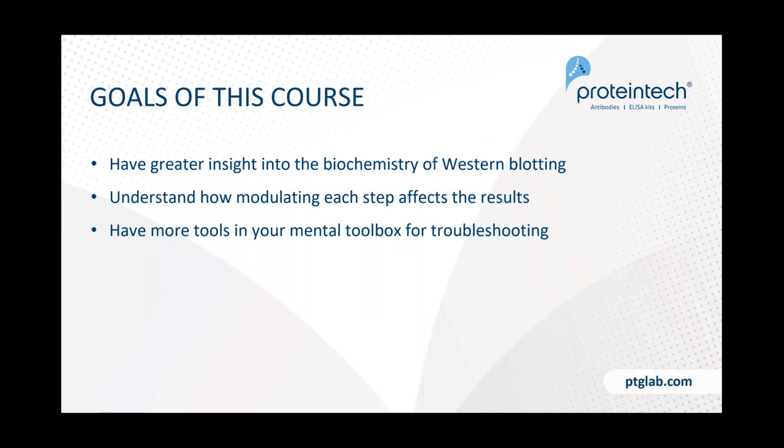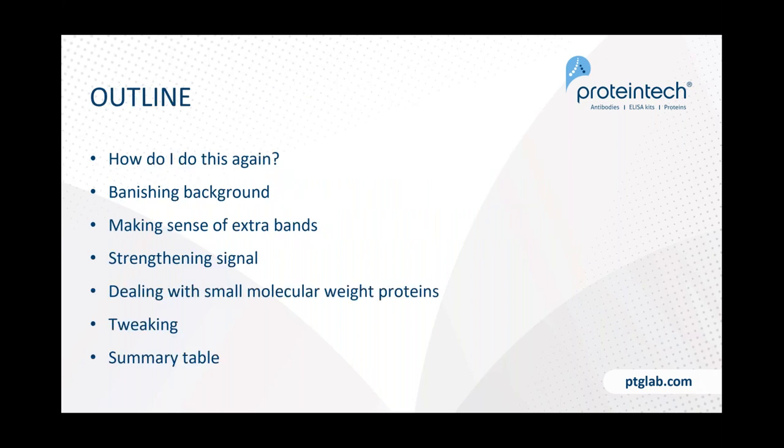Now the meat and potatoes of the refresher course. The goal is to give you greater insight into the biochemistry of western blotting, understand how modulating each step affects results, and have more tools in your mental toolbox for troubleshooting. We'll cover: a basic refresher on the workflow, how to banish background, making sense of extra bands, strengthening signal, dealing with small molecular weight proteins, some other tweaks, and a quick summary.